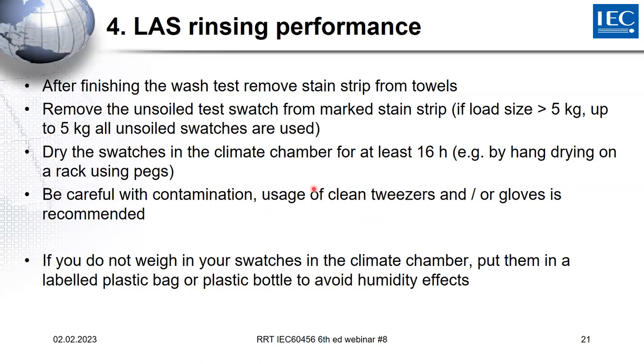So that's why we say, okay, please use clean equipment, like clean tweezers, clean gloves. Do not, after weighing in detergent, go directly there and handle those swatches, because this might lead to cross contamination and to effects where you wonder afterwards why you have increased LAS measurement.